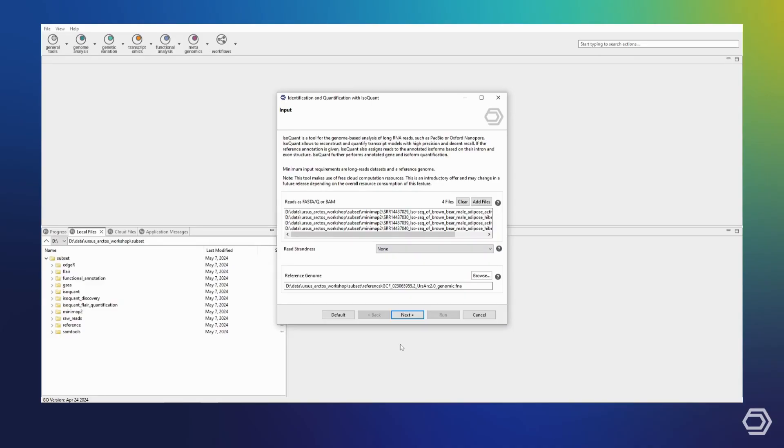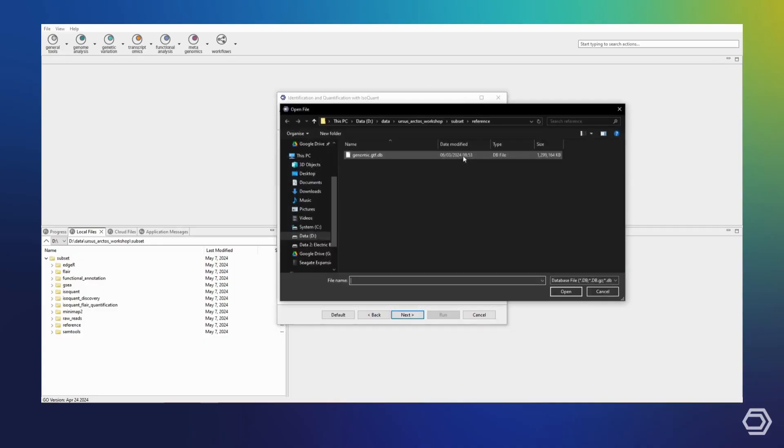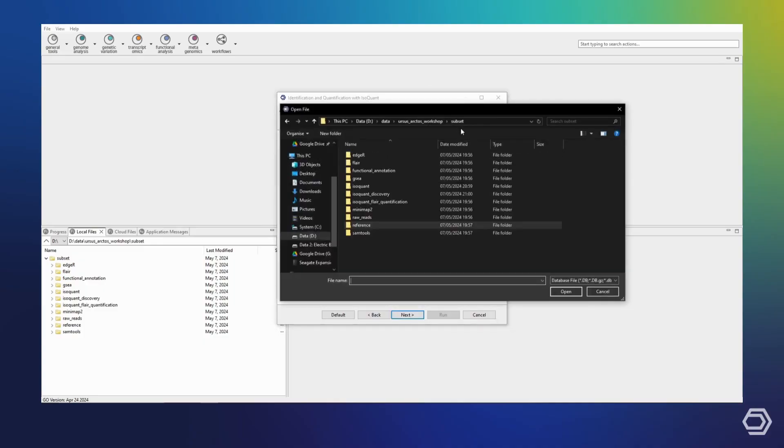I am not interested, however, in having IsoQuant discover any novel isoforms. In this case, I will leave the input options the same, but as a reference annotation, I will now select the GTF file of my previously refined transcriptome.